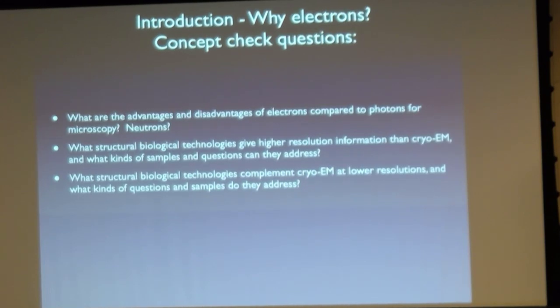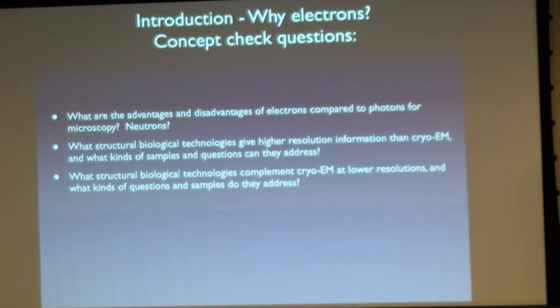Anything else you want to know at this point? I have a lingering question about the alignment. When you're looking for the eccentric height, are you changing the height of the stage or the height of the objective? Okay, you're doing two things.